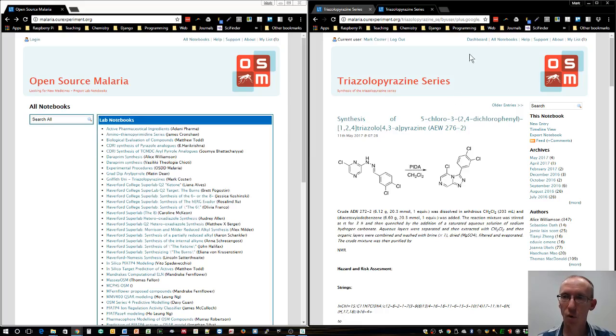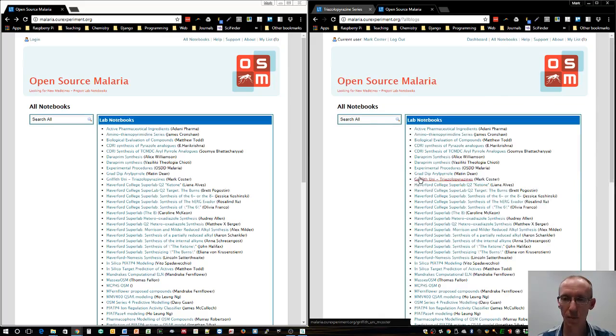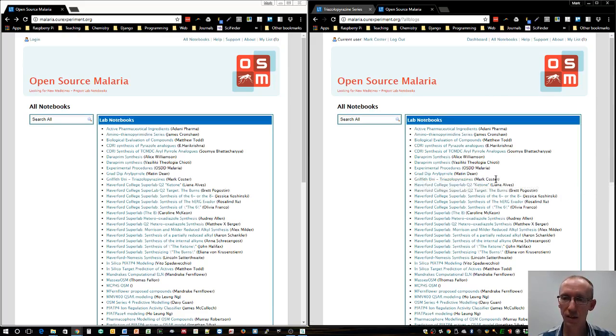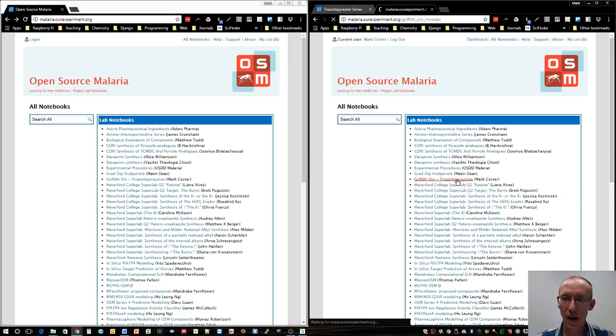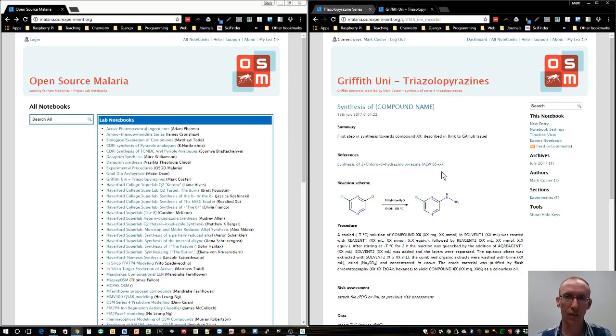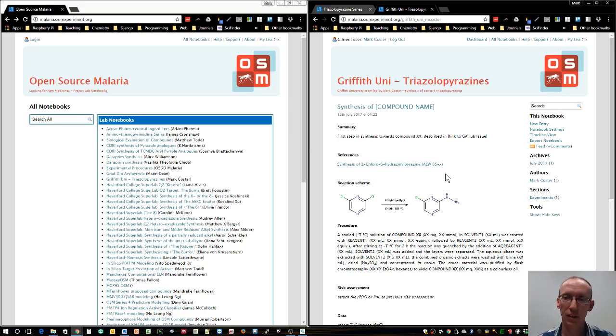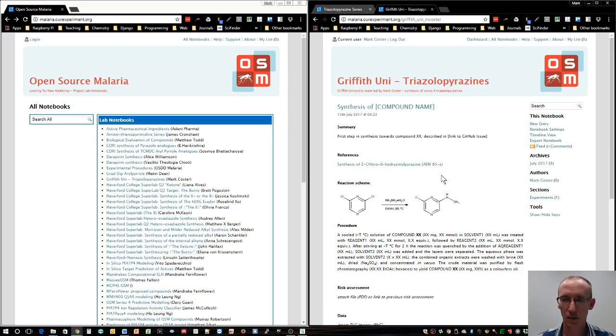What we're interested in is contributing to the Griffith Uni lab notebook. I've set one up under Griffith Uni triazolopyrazine. My name is attached because I set up the notebook, but anyone can contribute to it. That's part of the open source nature of the project, so each of you can contribute under your own login.